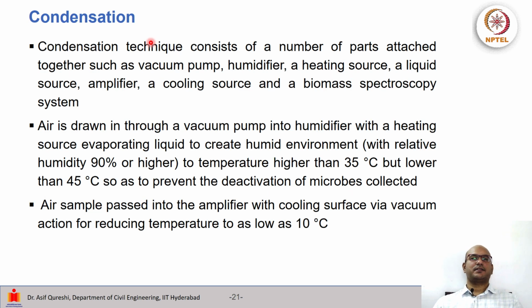The next technique is condensation. The condensation technique consists of a number of parts attached together, such as a vacuum pump, humidifier, a heating source, a liquid source, amplifier, a cooling source, and a biomass spectroscopy system.